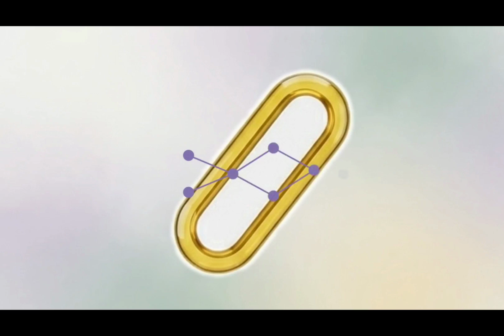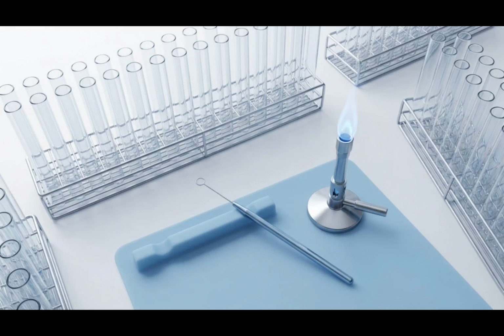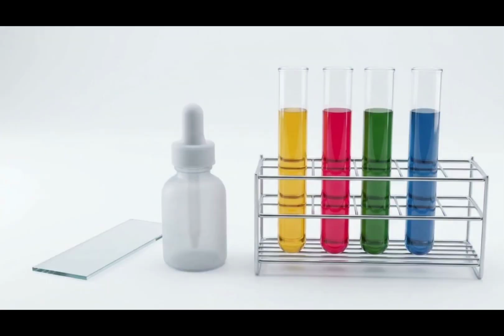We do that by tracking its metabolic pathways, feeding it specific sugars and substrates, and observing exactly what it consumes and what byproducts it leaves behind. For that, we use a specific series of biochemical tests. We start with the gold standard rapid screens, then move into the 4-part IMVIC panel.